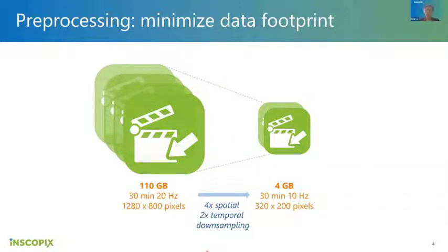Yeah, I think we have a built-in function to export the movie. Within IDPS, we have the export function. Yeah, I forgot. I think that's a great point to bring up. For some people, if they have their own pipeline to analyze, they don't want to analyze ISXD or use the API. They just want the TIFF file. Yeah, exactly.